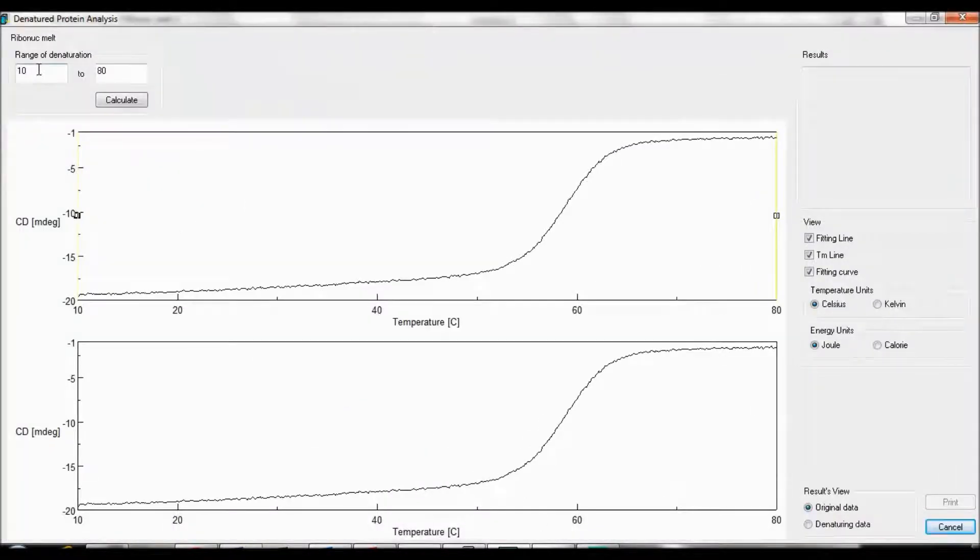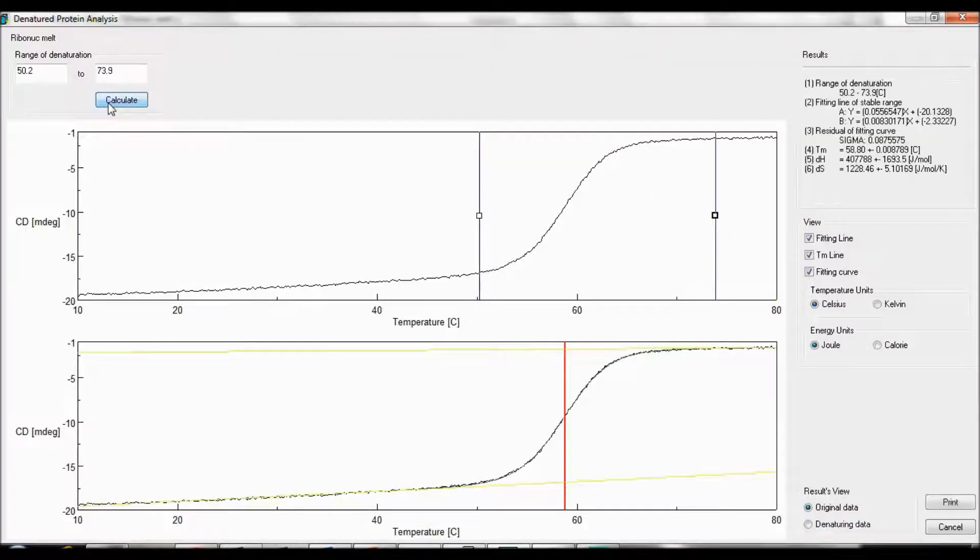First we need to enter the temperature range of denaturation. We can do so by either manually entering the temperatures here or clicking the boxes and moving the lines to the plateaus a little before and after the CD increases. Then click Calculate.